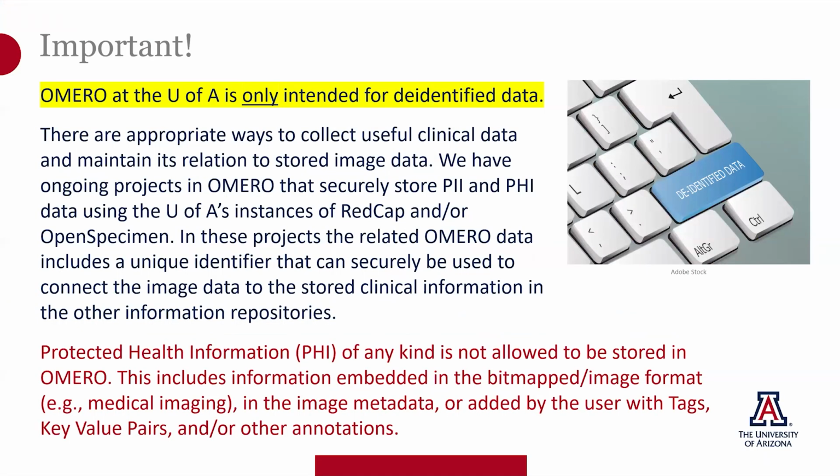Before we get started, this slide is a reminder that OMERO is only intended for the storage and management of de-identified data. That's not to say that we can't work with clinically relevant image data. We have some groups doing patient-related research who have image data that incorporates a unique identifier into the file name. The unique ID relates that image data to a similar ID in REDCap, which is clinical data, or Open Specimen for biorepository type data. Those softwares are designed for this kind of data. The point being that it's not impossible to work with patient-related data. You do need to be very careful.